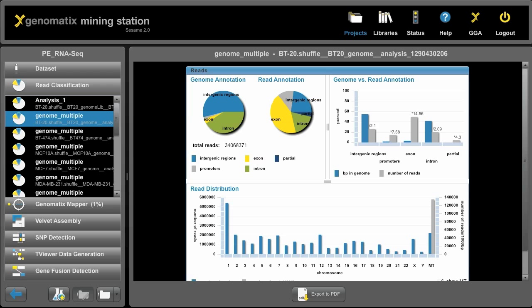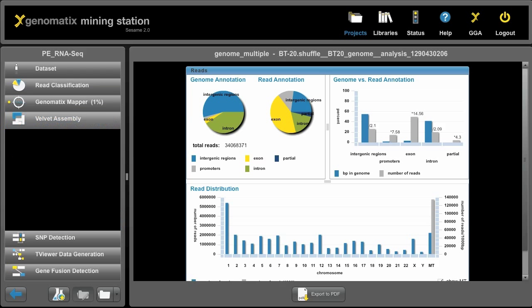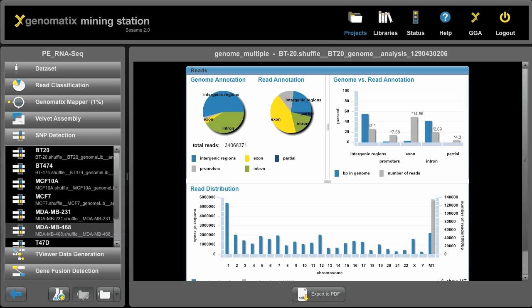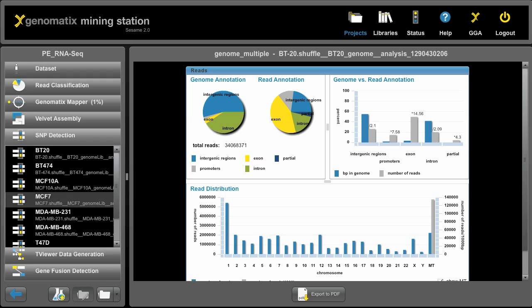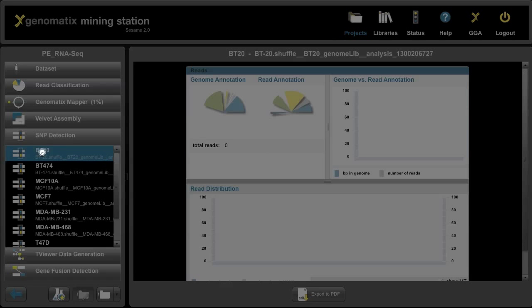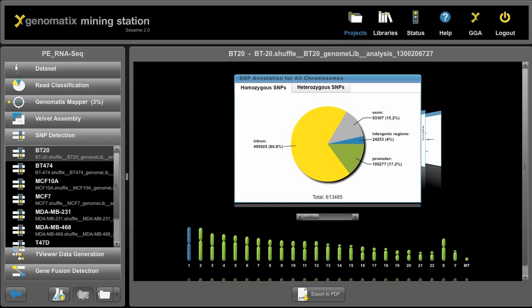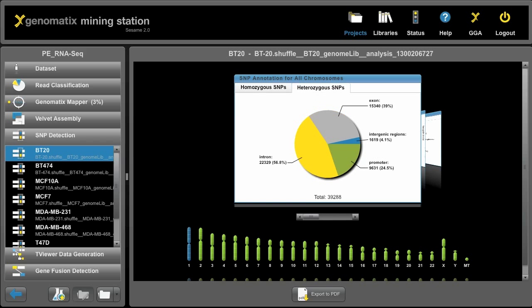We can look at velvet assembly results. We can look at SNP detection results. For example, let's click on the SNPs that we've called with the BT20 cell line. Here for example, we see the statistics about SNPs that were called in the introns, exons, if they were homozygous or heterozygous.